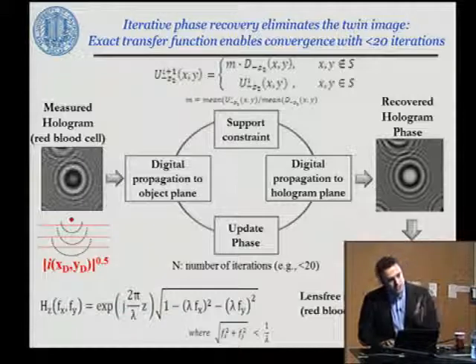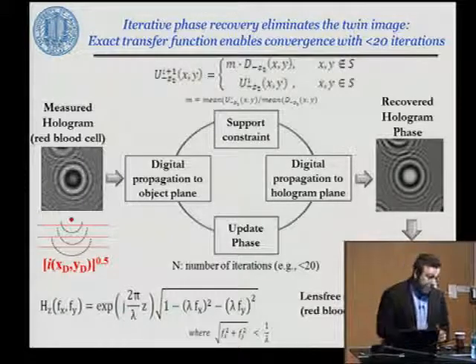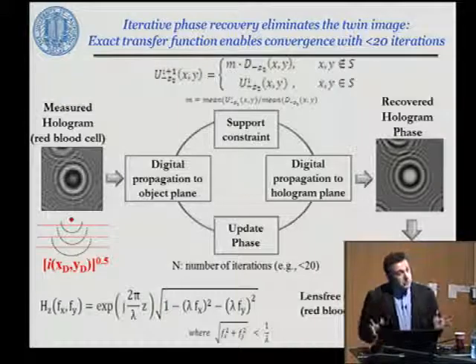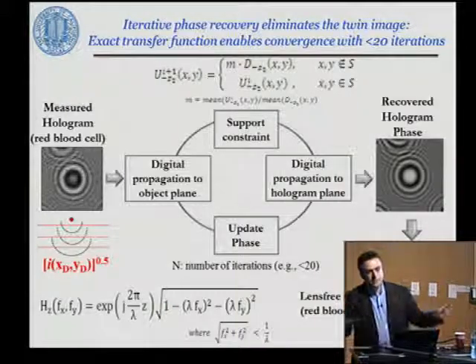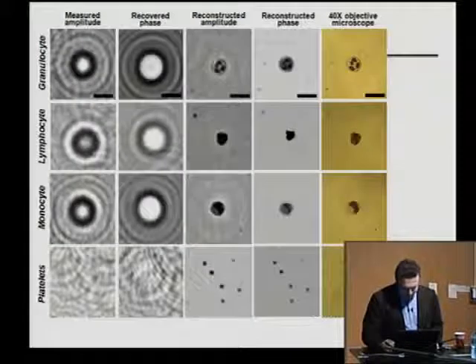But this is a good start to understand that you need to do phase recovery, and we always do this iteratively. And typically, these are fast algorithms that rely on FFTs. And GPUs help a lot because different parts of your field of view can be distributed to different cores.